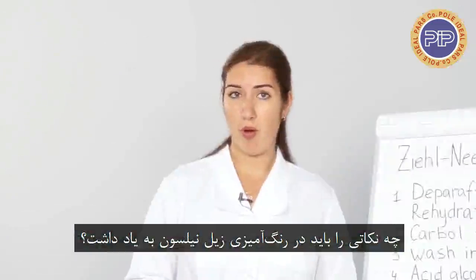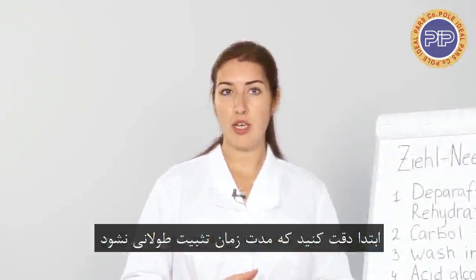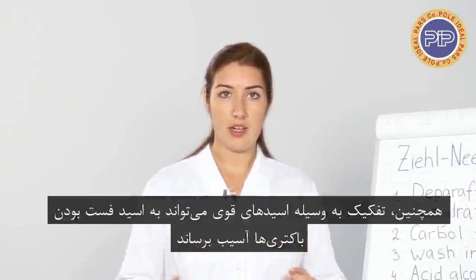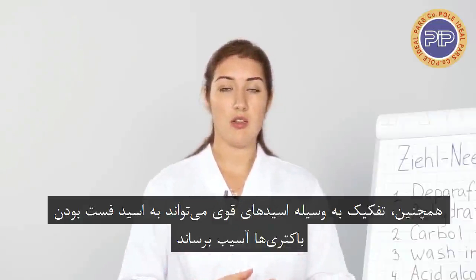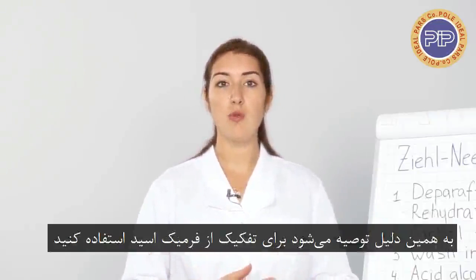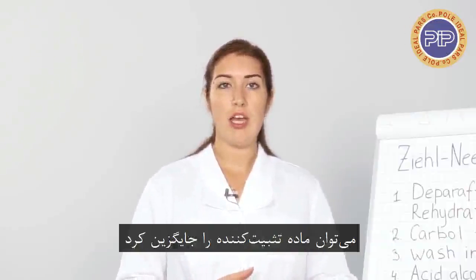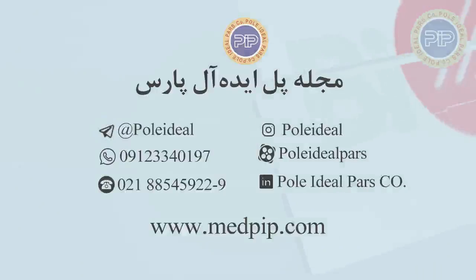What is important to remember when you apply a Ziehl-Neelsen stain? First of all, care should be taken to avoid over-counterstaining, as the scant organisms can be easily obscured. Secondly, decalcification with strong acid can destroy acid fastness of bacteria. Thus, formic acid is recommended to be used for decalcification. And besides, the counterstaining agent can be substituted if color blindness causes recognition problems.